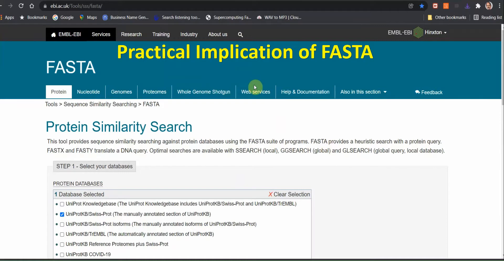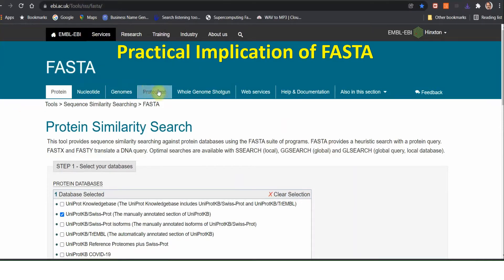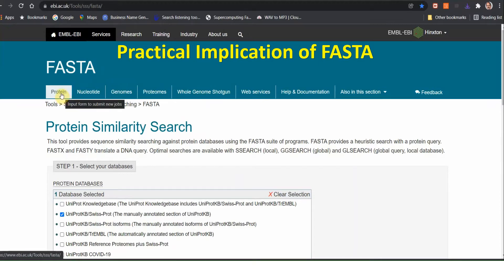First of all, you just type in the address bar: ebi.ac.uk slash tools slash sss slash fasta slash. Then you will get a new window, and this window will appear like this. It is actually the FASTA window, and in this FASTA window there are a lot of options: protein sequence analysis, nucleotide, genome, proteomes, etc.